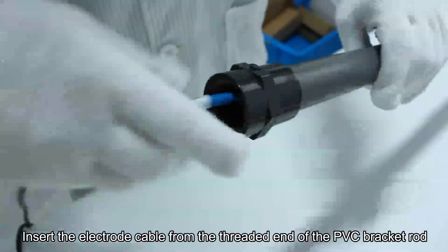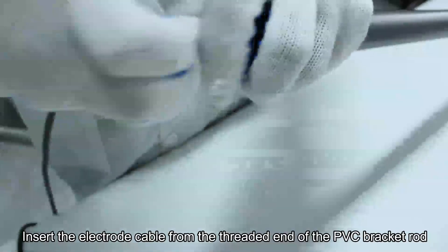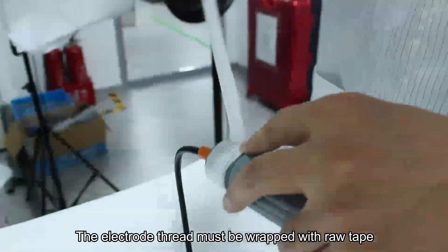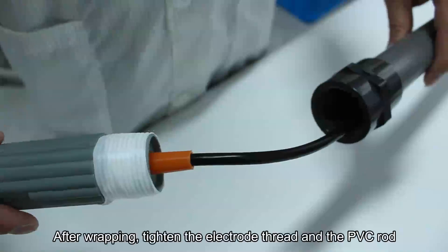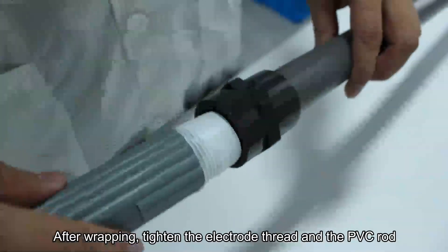Insert the electrode cable from the threaded end of the PVC bracket rod. The electrode thread must be wrapped with raw tape to prevent water from seeping in. After wrapping, tighten the electrode thread and the PVC rod.